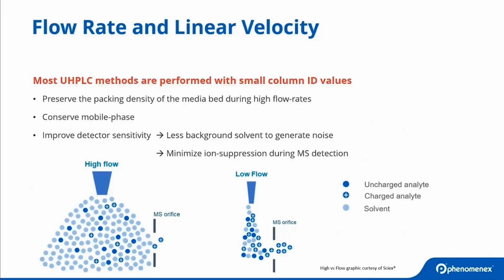And this ultimately presents challenges with respect to the sensitivity towards your actual analyte that is being introduced within that large volume of eluent. Certainly you could just increase the mass load onto the column, but then you're once again running into complications with respect to the upper limitations of what your mass spec detector can handle.